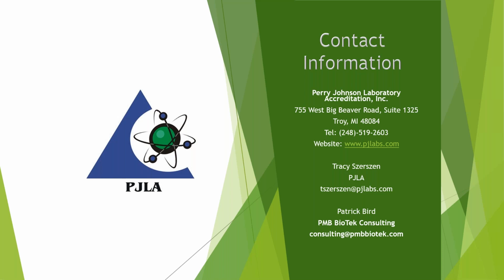If you go much lower than 30, you're going to have issues probably getting recovery. And in reality, while these methods often have a 1 or 2 CFU limit of detection, you're often not going to see organisms at that level. So a verification of the sensitivity at a higher level is acceptable. And that's recommended by ISO and the FDA for food testing.